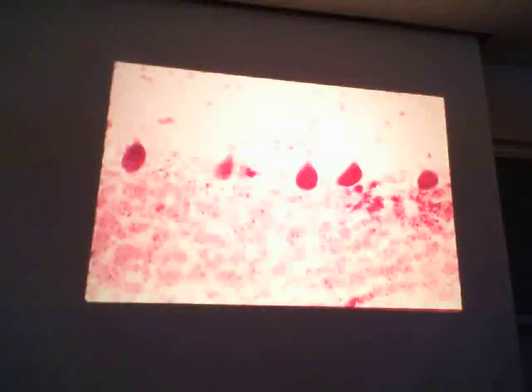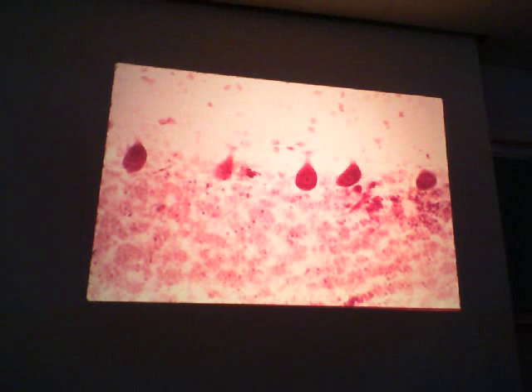Okay, and then right here we have a what? Purkinje cells. Now, Purkinje cells could be put on the lab practical even with either an H&E or perhaps with some sort of metallic staining. And those that have been stained with metallic staining are going to show more of the processes. So these are several Purkinje cells right here, sending their processes up into that molecular layer.